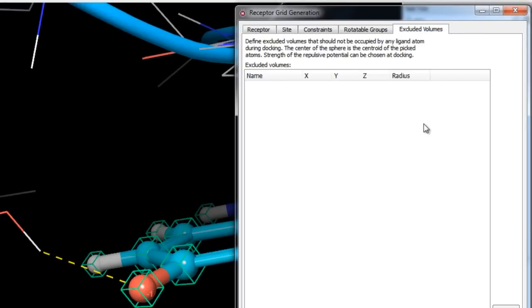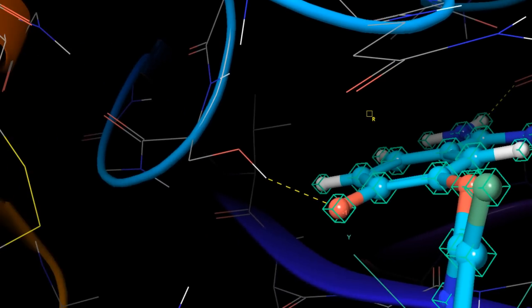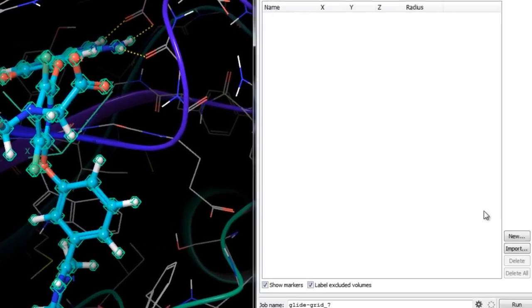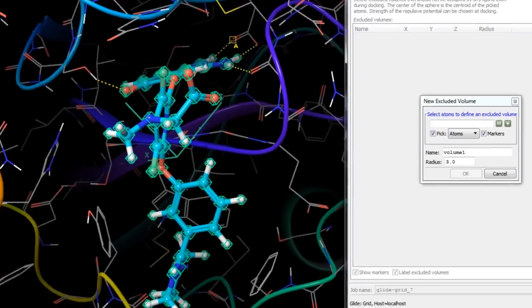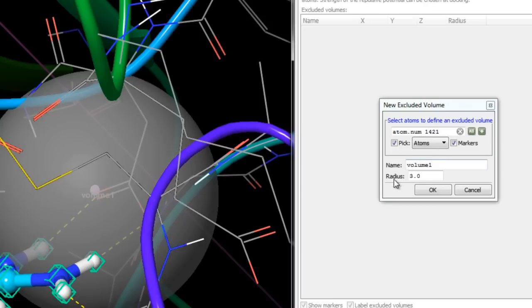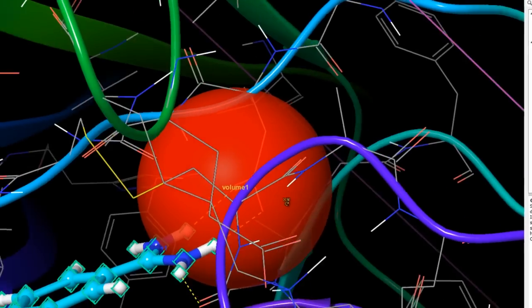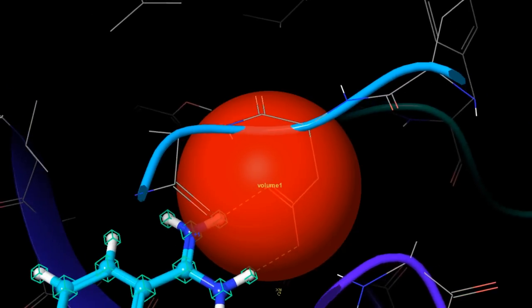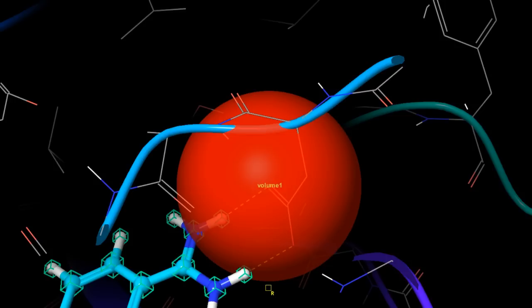In the Excluded Volumes tab, you can set up excluded volumes to prevent docked ligands from occupying certain regions of space — for example, a pocket where ligands are known not to bind, or a region where parts of the protein are missing. We'll create one as a demonstration: click New, ensure Pick is selected, then pick the carboxyl oxygen interacting with the amidine. Leaving the default name and radius, click OK. The resulting red sphere represents the excluded volume, which would prevent ligands from binding into this region of the active site.